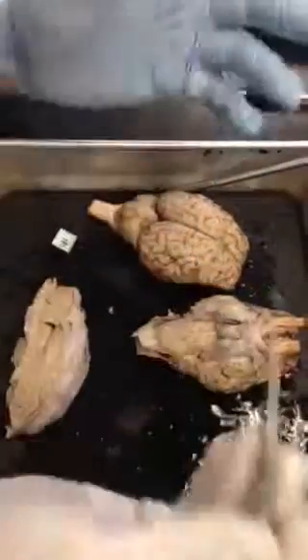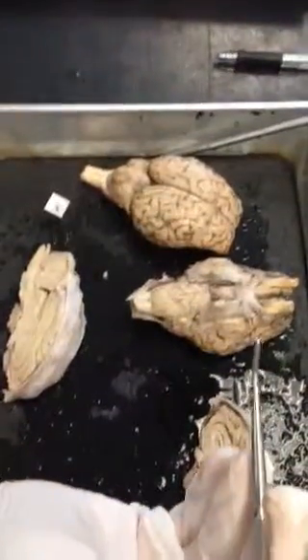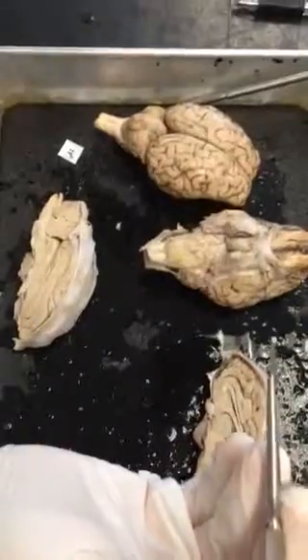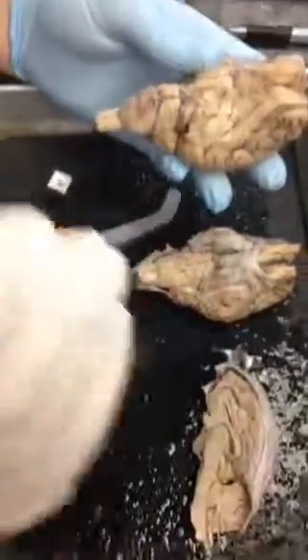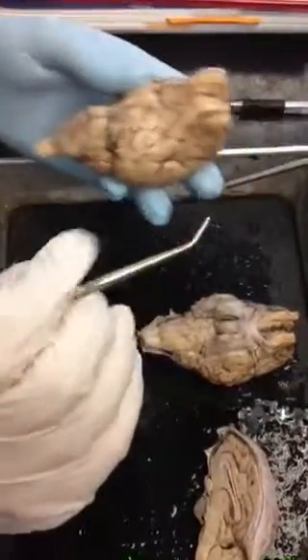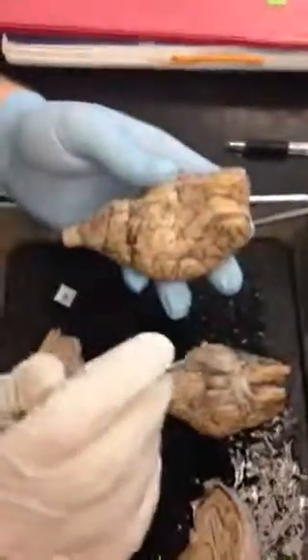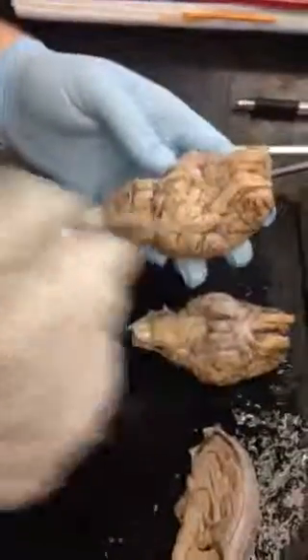And I think that's it, pretty much. Flow of the CSF again. You should have gone over that, right? That's on the sheet as well, or somewhere on Moodle. There's the flow. You want to see the interventricular foramen? No, it's tough. You probably will not have it.